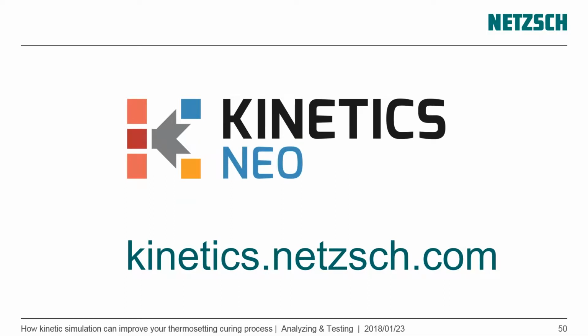So you can have a look at that using Kinetics NEO. You can model that and you can see that. And you can take this into account during modeling. So you can split your kinetic models into 2, 3, 4 different steps.